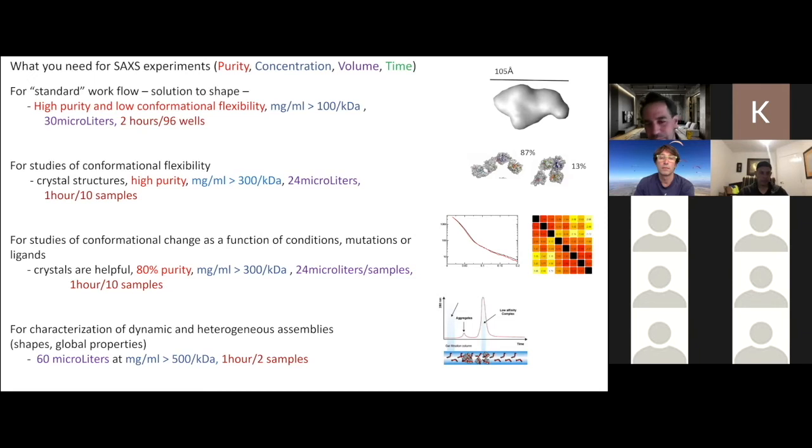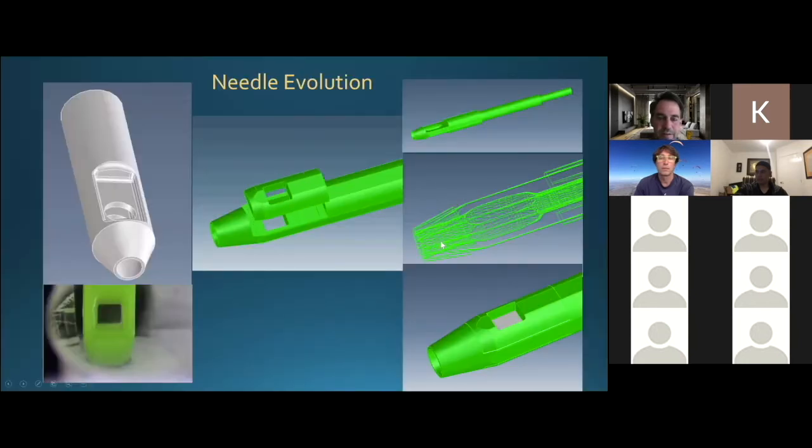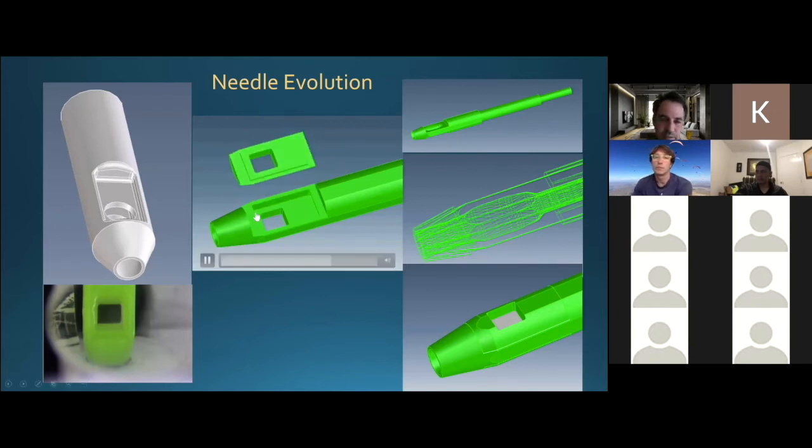So we've been going through these needle processes. You can see some legacy needles in the bottom here, and actually our newest needle is this one right here. You guys probably can't see the movie, but basically, the needle is 3D printed these days, and we've been able to protect the mica window as it enters a covered plate by recessing the window, et cetera.